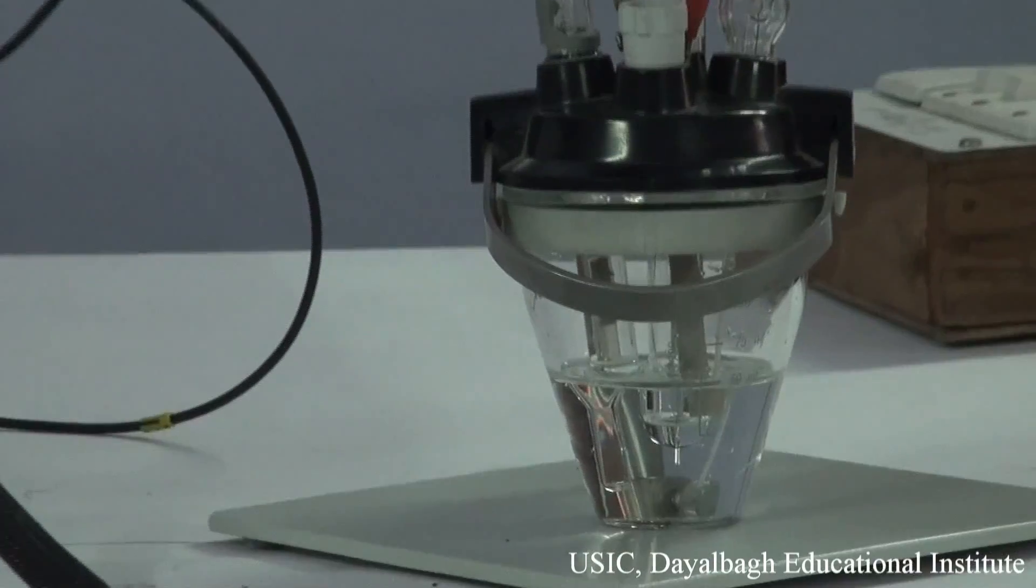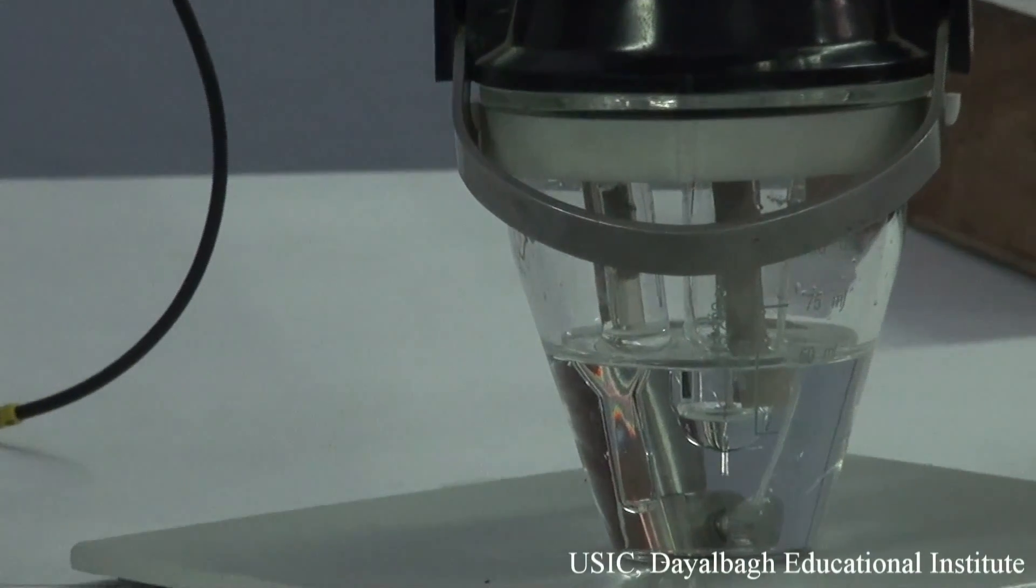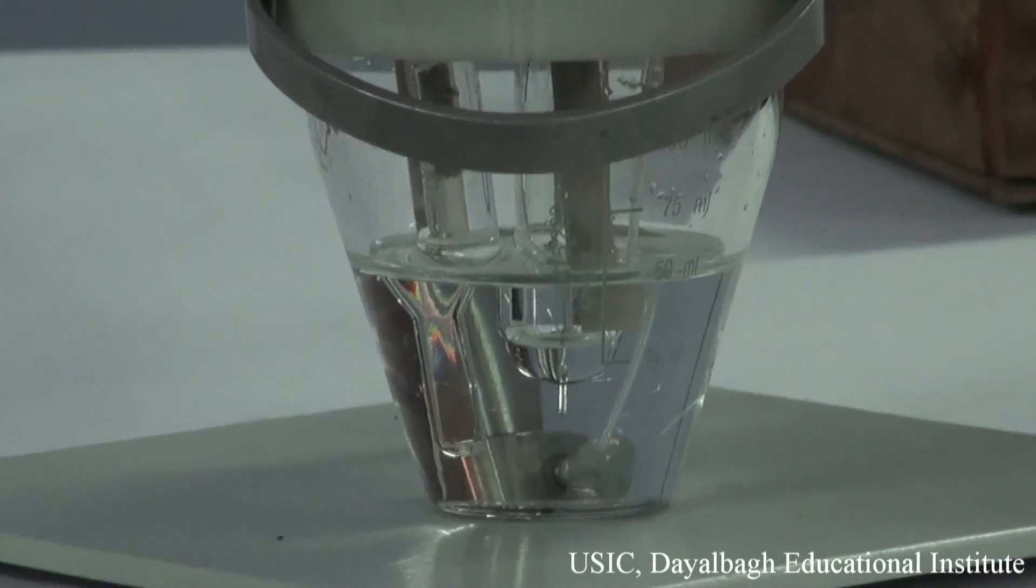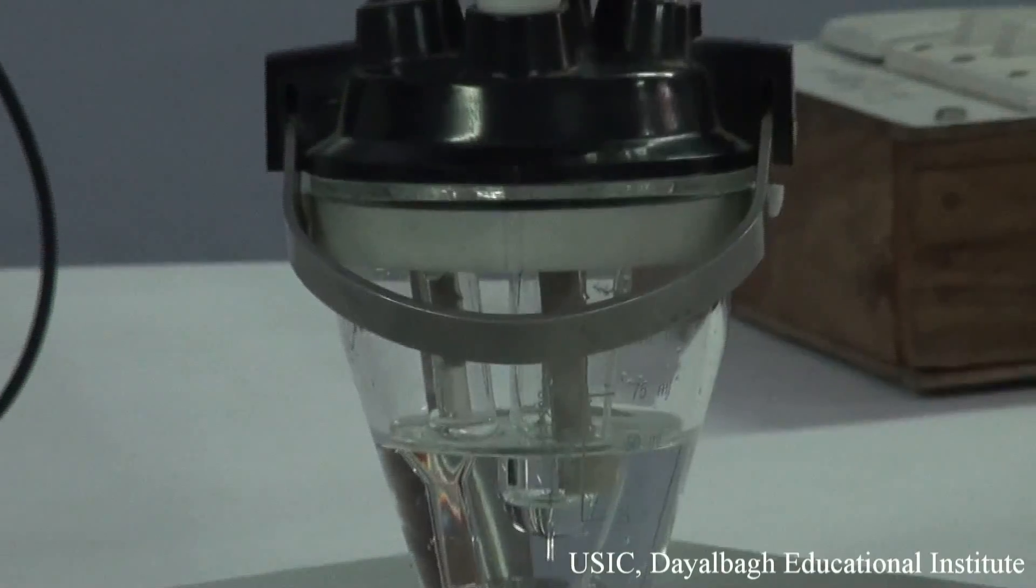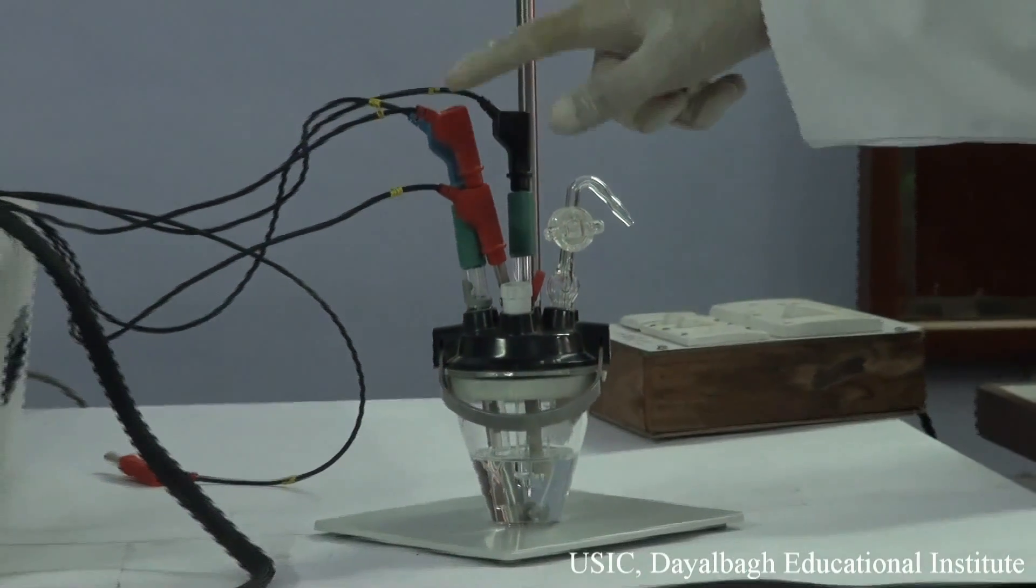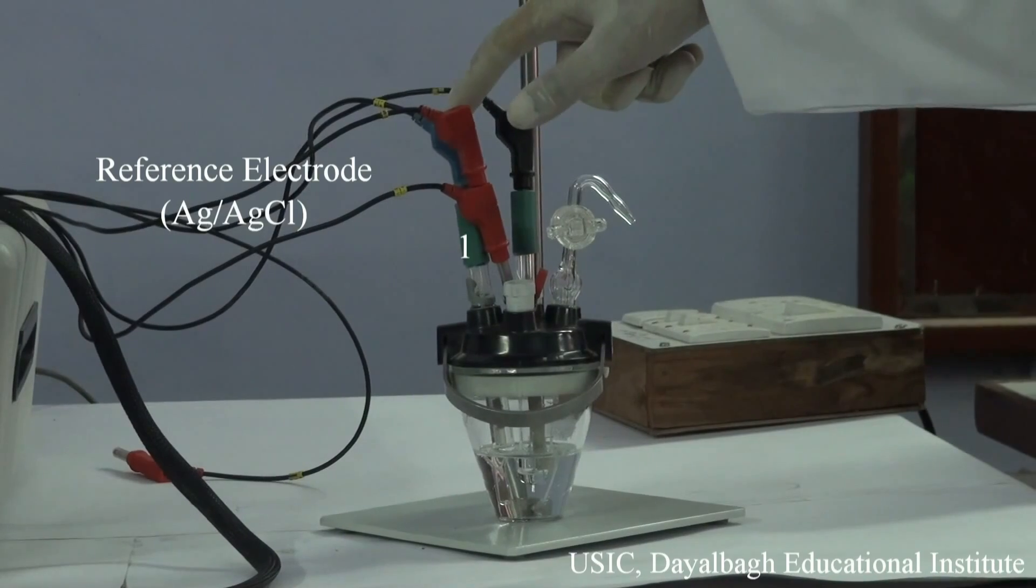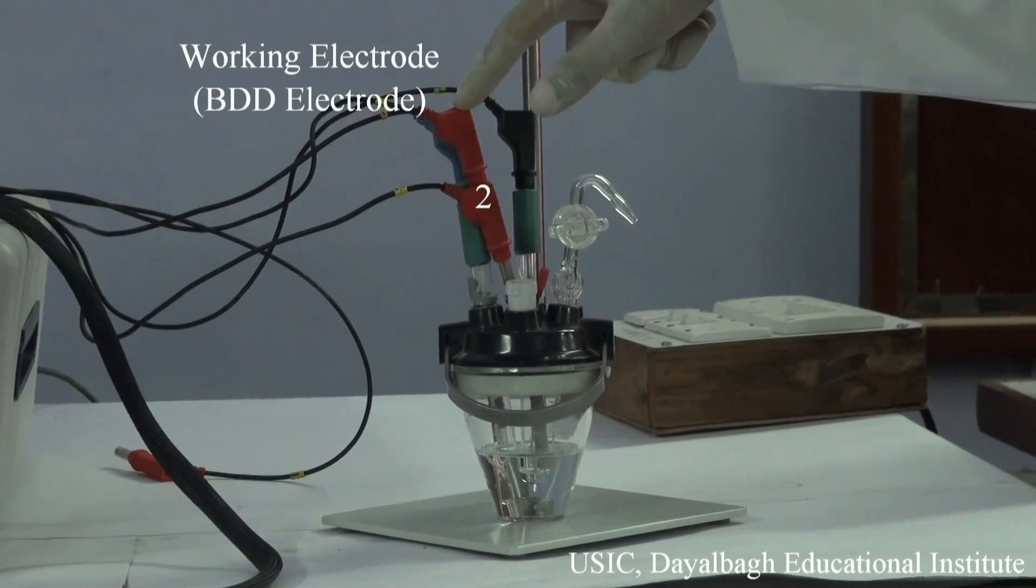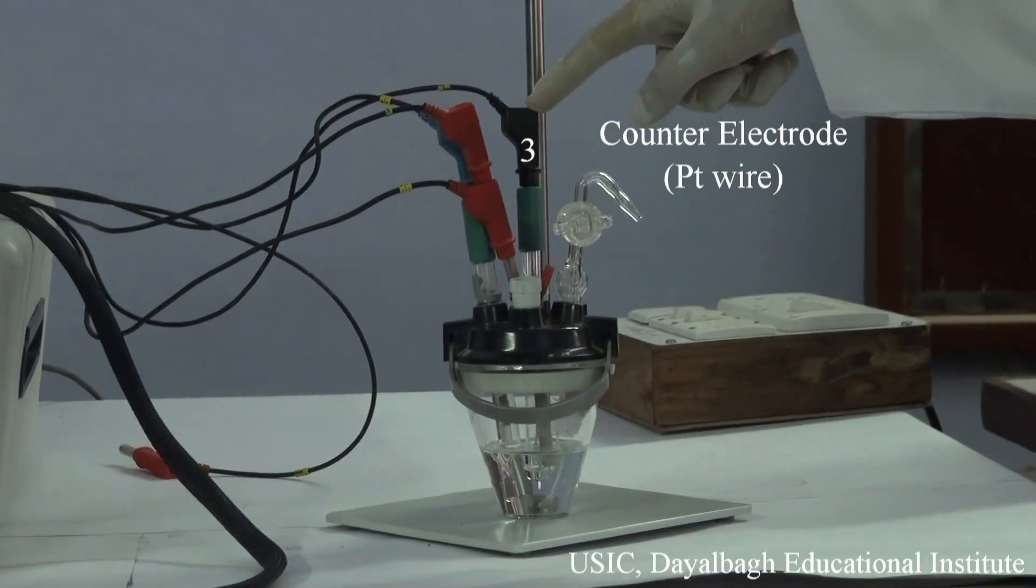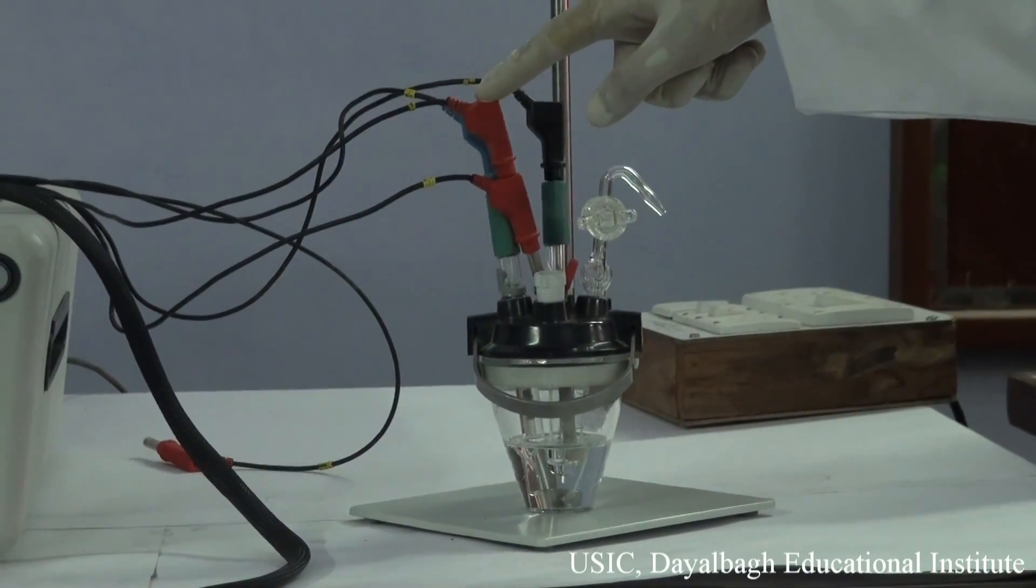Now, we can see the three electrode system. The reference electrode, that is silver-silver-chloride electrode. The counter electrode, that is platinum electrode. And the working electrode which we are using is boron-doped diamond electrode. This is the three electrode system where reference electrode will provide the potential to the boron-doped electrode, and this counter electrode will balance the current of the boron-doped electrode.